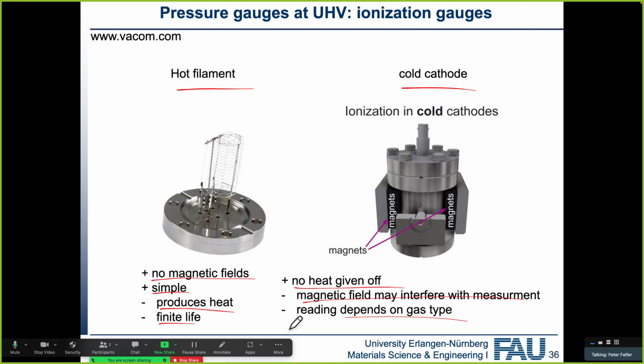Okay, and for us, very important, just like the ion getter pumps, we also get ion emission. Some of the ions that get ionized make their way out of the gauge and can get sucked into the detector as well, which just means we need to be strategic about where to place the gauge. Typically, of course, you get a lot less emitted from them compared to ion getter pumps.